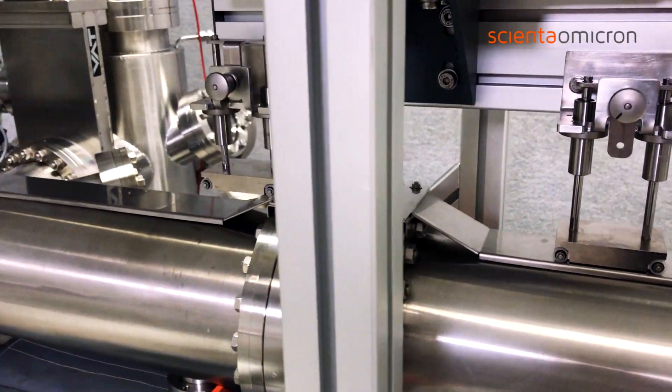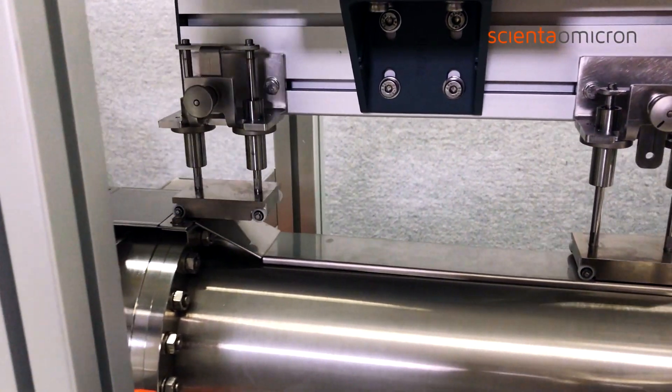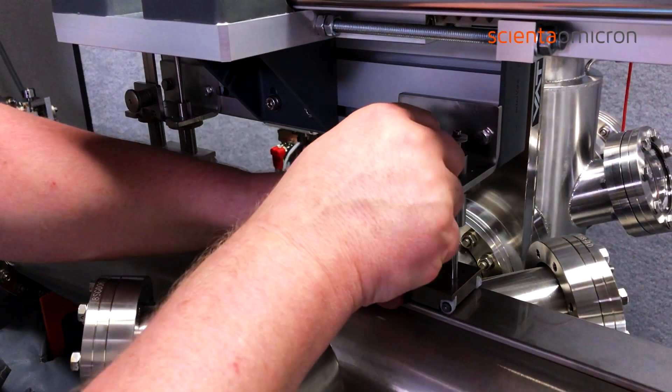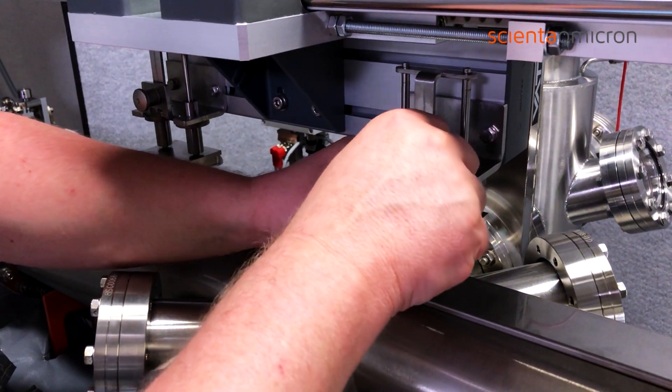Optimized pumping and quality design ensure true UHV conditions while providing a high degree of configuration flexibility.